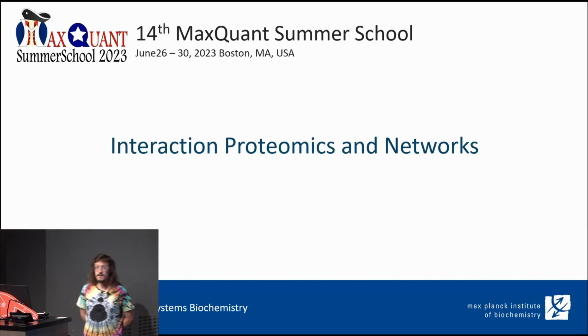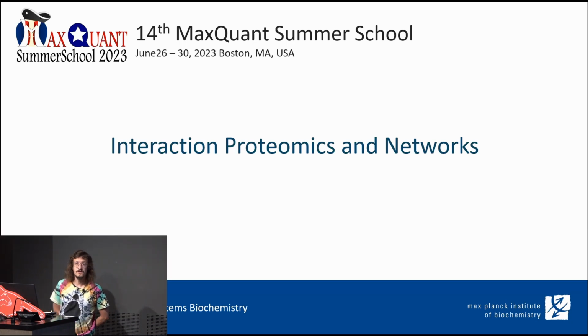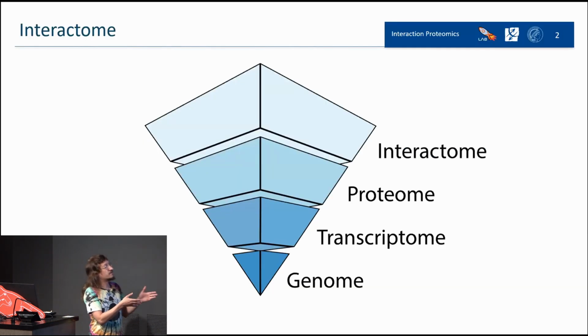Okay, good morning, everyone. So the topic now will be interactions and network. After the brief introduction about the multi-omics that Shintru did, we will talk now about complexes and protein-protein interactions.